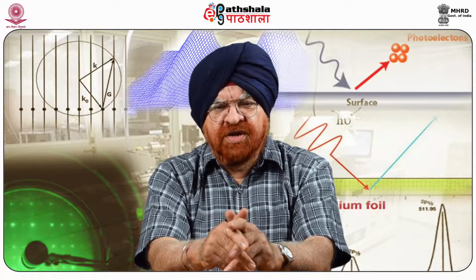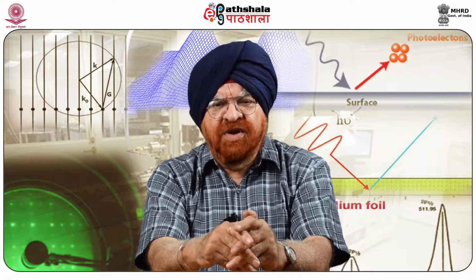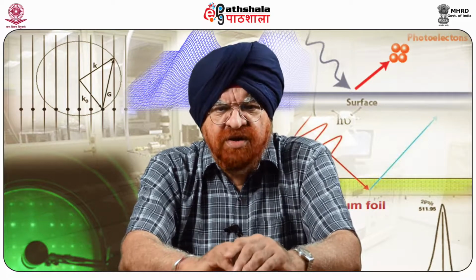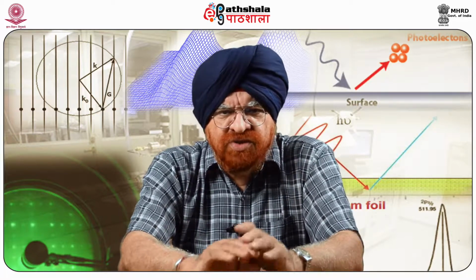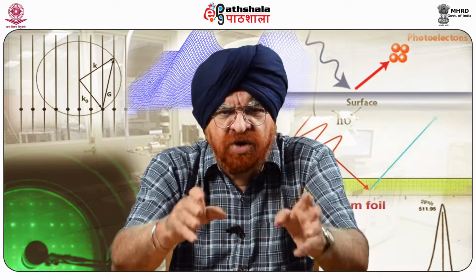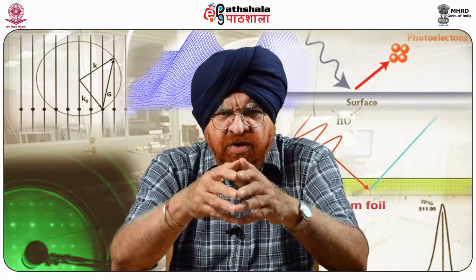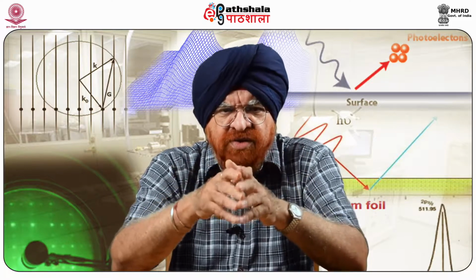Now I'm sure one is very keen to learn about the historical background of this equipment. CFM was primarily developed by Charles Lieber at Harvard University way back in 1994. The method was demonstrated using hydrophobicity, where polar molecules, for example COOH, an acidic group, tend to have the strongest binding to each other, followed by non-polar, for example an ethane, CH3 molecule bonding, and a combination of the two being the weakest one can get.